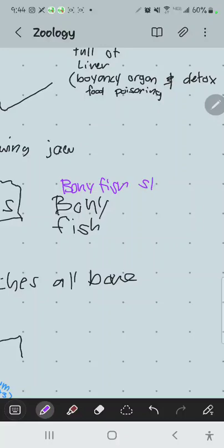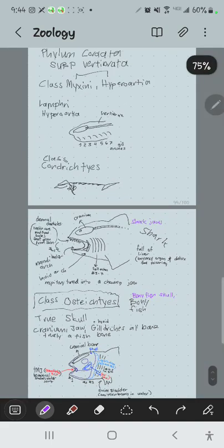And then we'll have a shark dissection. In the shark dissection, we're going to look at some internal organ structures of the shark. They're very, very similar to what you find in the bony fish, except the bony fish would have a swim bladder, whereas the shark doesn't. Okay? All right, so let's go ahead and take a look at our shark features here.